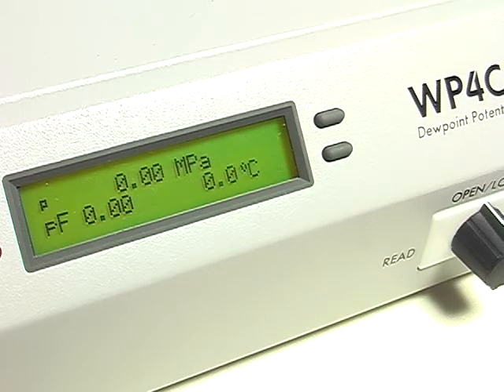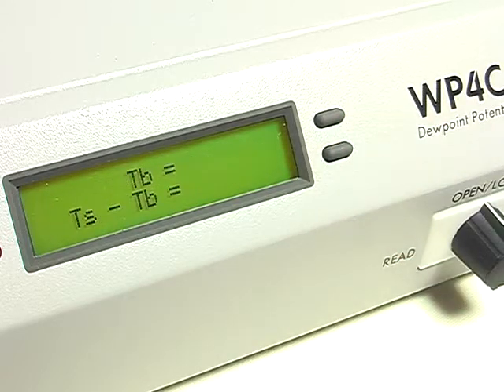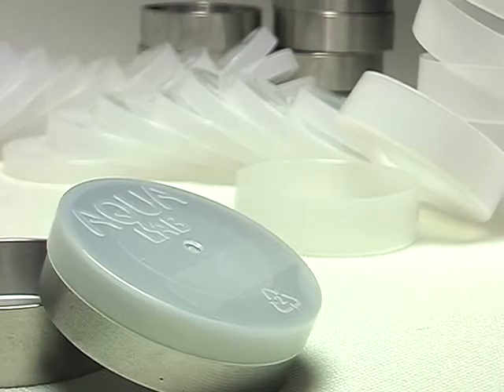Because water potential is temperature-dependent, all WP4C instruments come with temperature control. Let the instrument come up to temperature before you begin making readings.